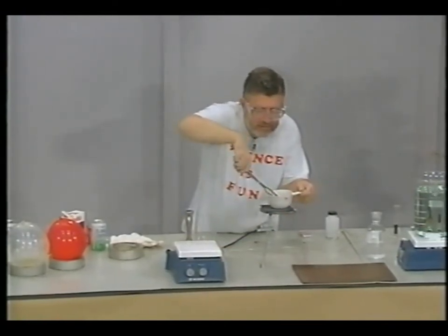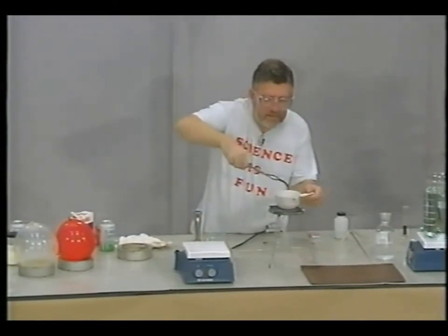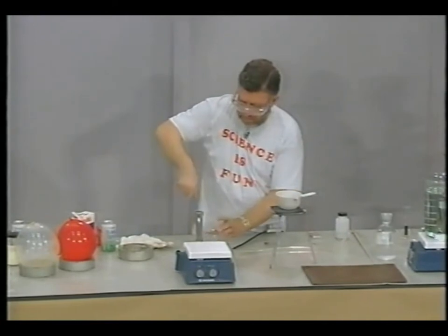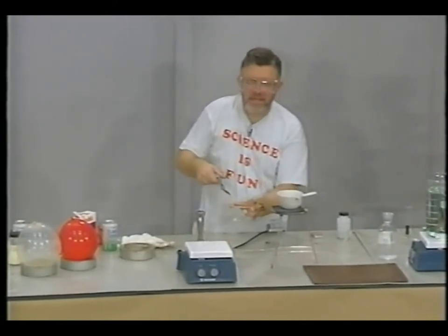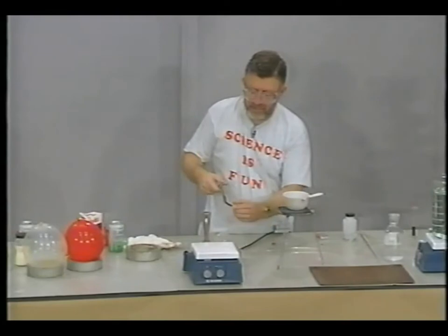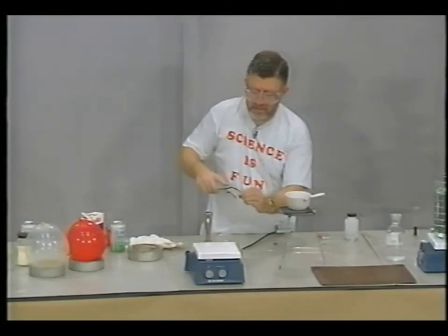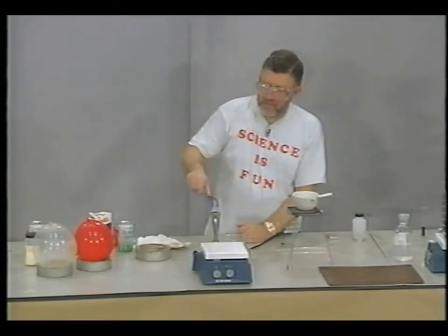Let's get this third one out. We did put three in there, right? There's the third one. Okay, so we see what we've done here. We've made ourselves some silver pennies. And what I'm going to do is take one of the silver pennies, and they're fairly safe to handle, so I'll just hold it like this. And then I'm going to put it in this flame here, and we'll see what happens to it.